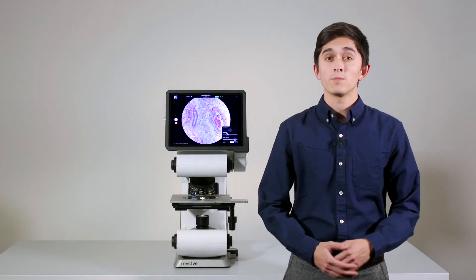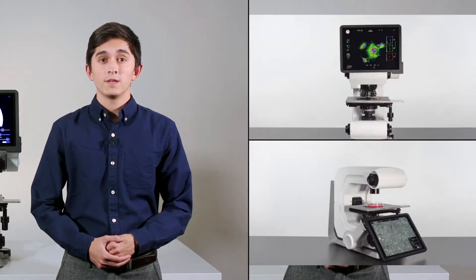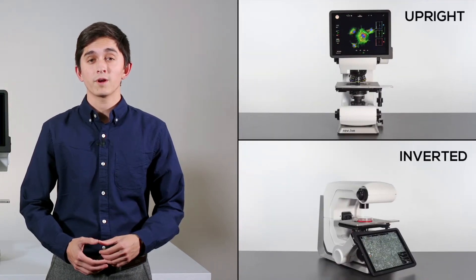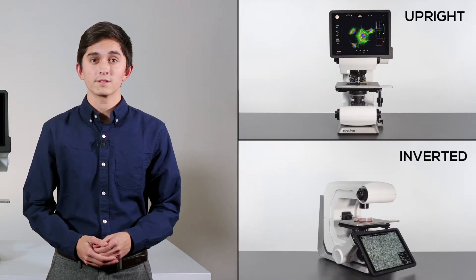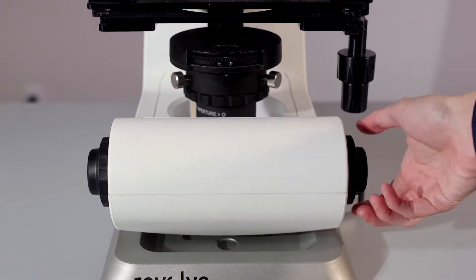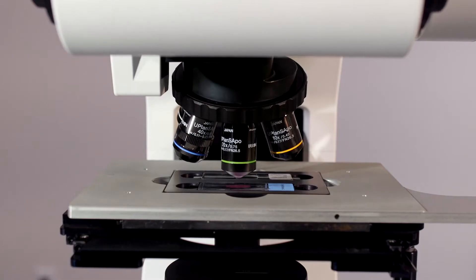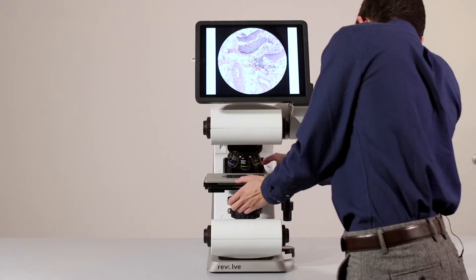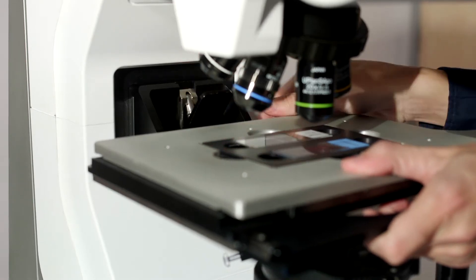One of the most unique features about the Revolve is that it has the ability to convert between upright and inverted configurations. To begin, first we'll retract the nosepiece turret. Then, we remove the stage by undoing the latch.